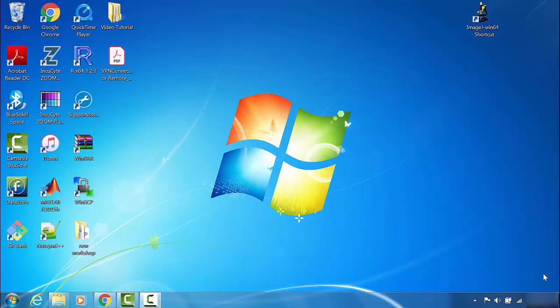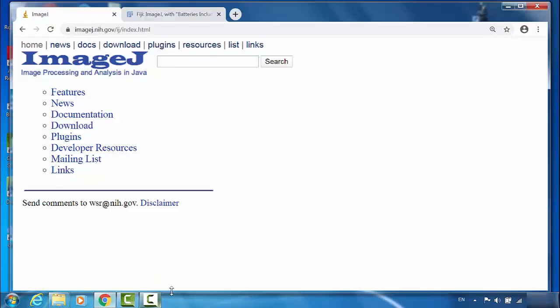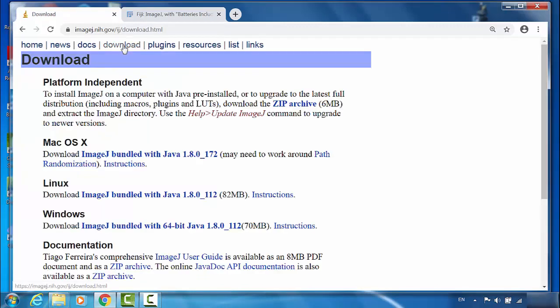Now we're going to download and install NIH ImageJ. We go to the website. This is NIH ImageJ. Go to the download page.